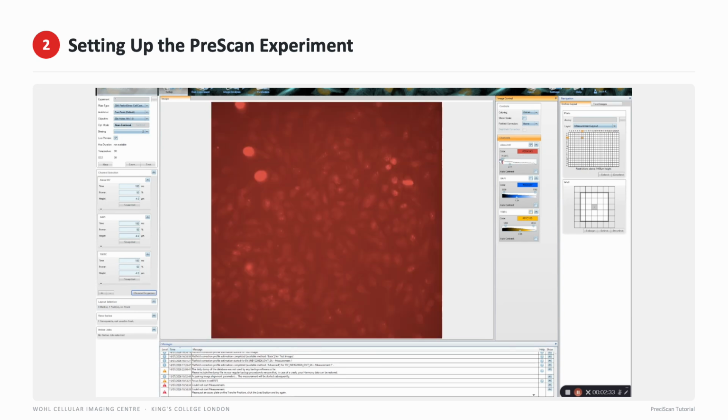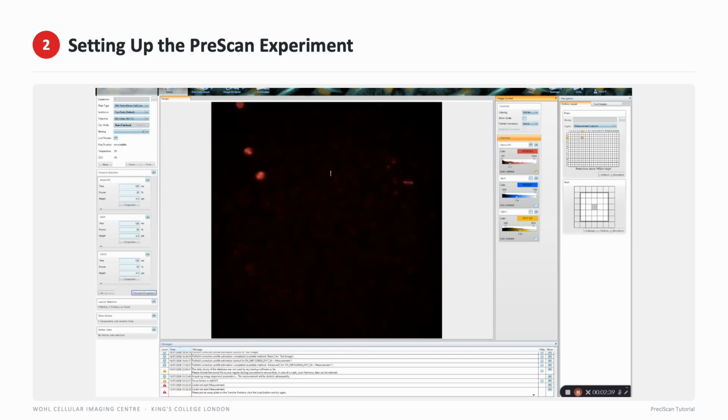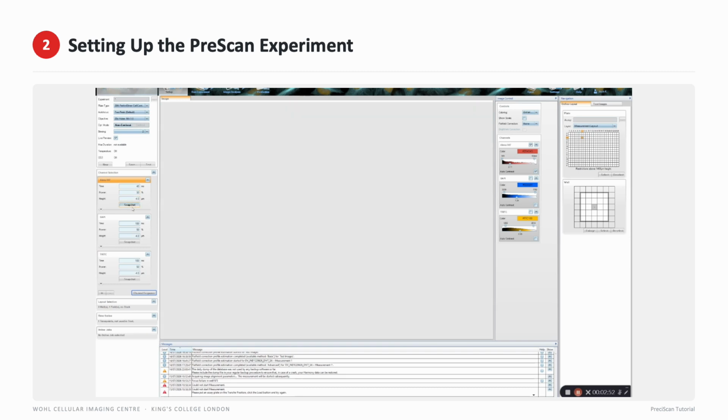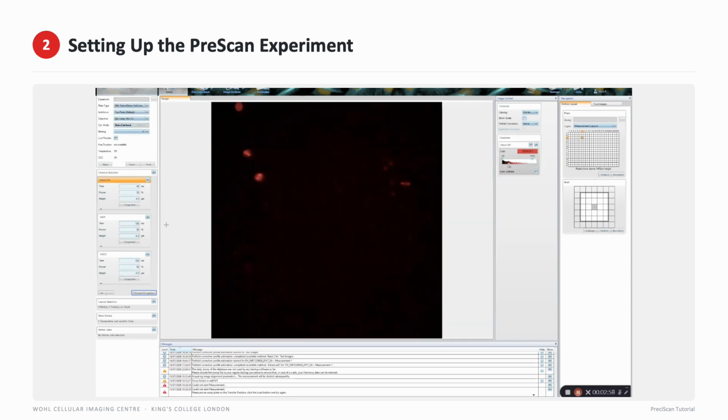What you do need to make sure you do is two main things. One is make a decision as to whether you want your pre-scan to be 3D using a Z stack or whether 2D will be sufficient. And obviously, if you're going to use a stack, keep the stack set up. If you're not going to use a stack, remove it and set the heights for each channel individually. And then you also need to optimize your imaging settings for each channel as you would for any other experiment, because we're heavily dependent on automated analysis working here to be able to identify our rare events.